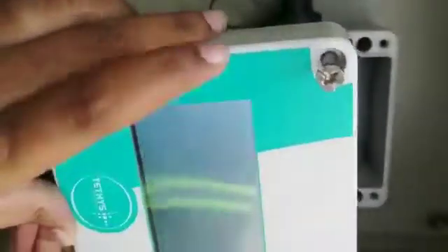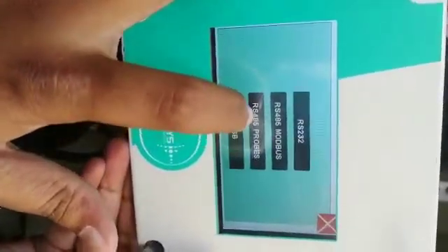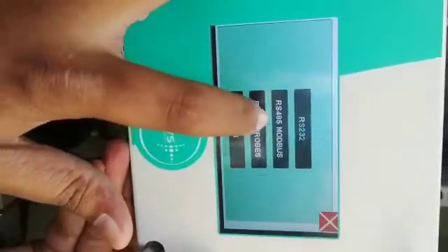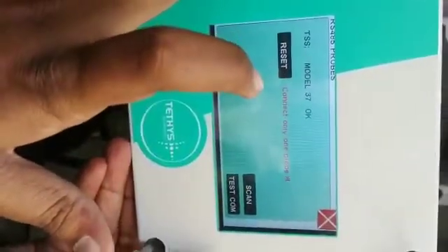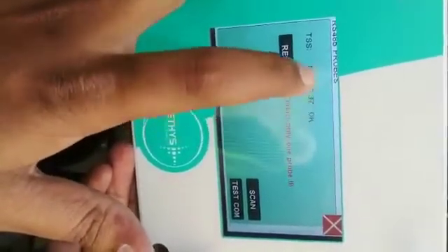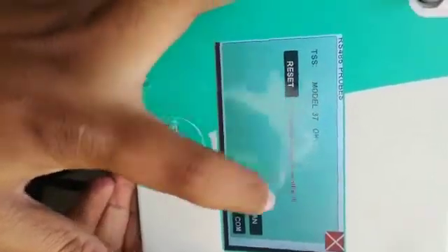First, we will set from port in settings — Comm. Select RS485 probe and start the scanning. After scanning, this will show you the connected sensor model number. Then press the close button.